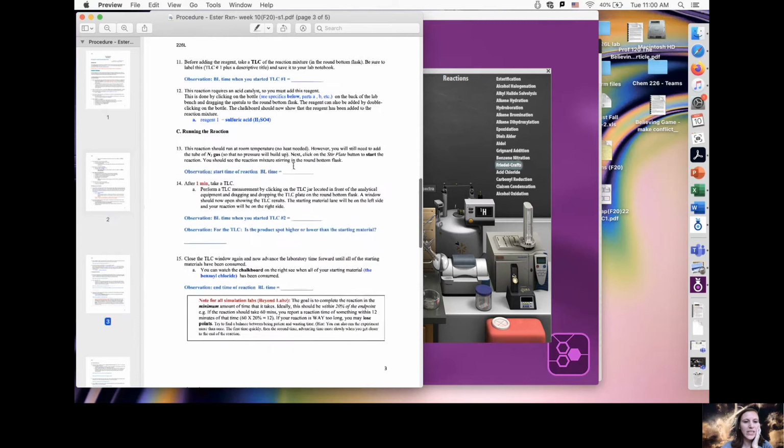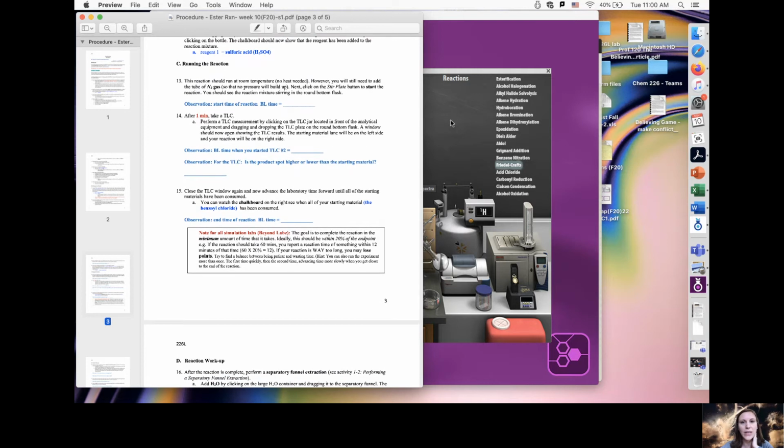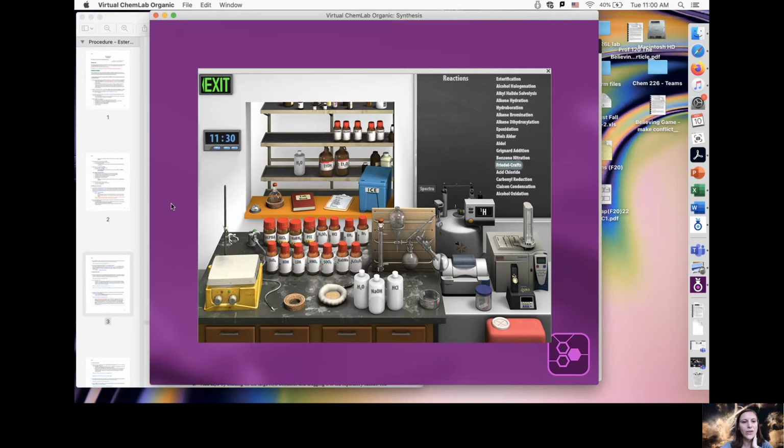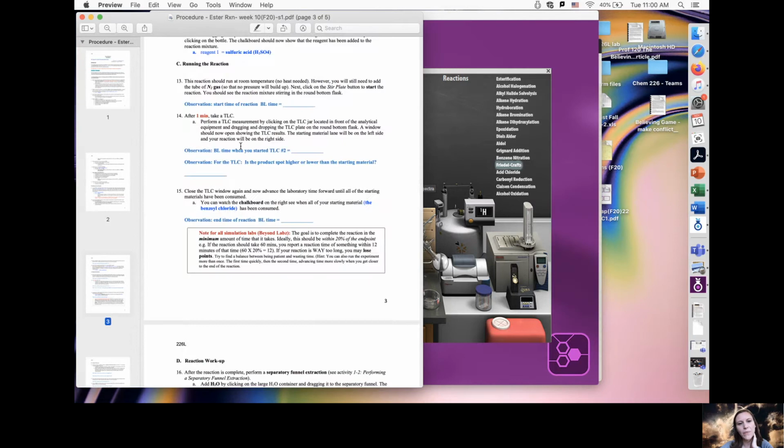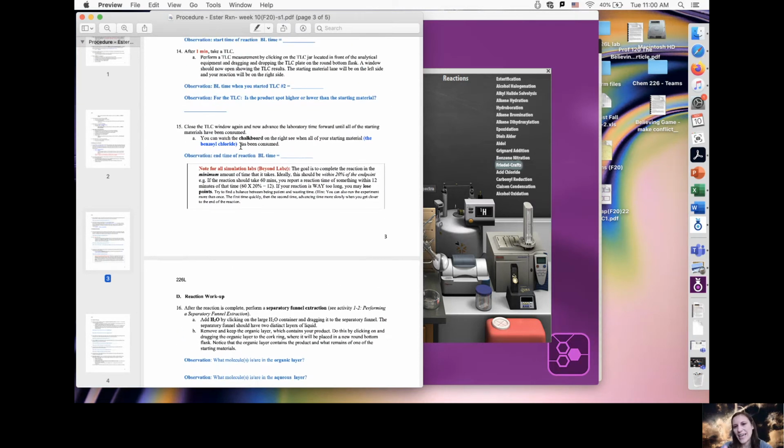So you just do the normal reaction. At this one, you want to take a TLC at 1 minute. That tells you already this is probably a pretty short reaction. So again, if you go over an hour, that's way too long, okay? So this is a short one, so that's good. And basically you can tell it's done by looking at the board on this side, and you're going to wait till something's gone. So we have more than one starting material, right? We have ethanol and benzoyl chloride. One of those is always going to be in excess. That's normal for a reaction. So I'm going to tell you which one to look for. Just look for the benzoyl chloride to be gone. Once that's gone, the ethanol is never going to go away. So just the benzoyl chloride, when that's gone, your reaction's done.